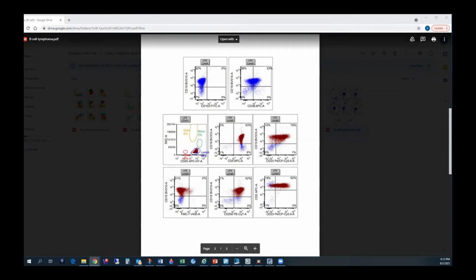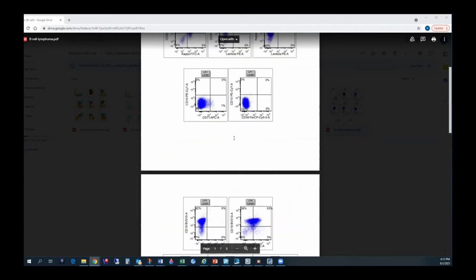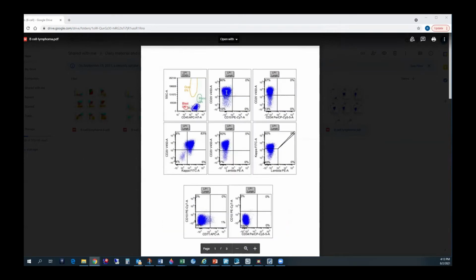One last thing, sorry. You just told about, in the very beginning, the plot of CD20 about the moderate intensity, that you said it's touching the line. What does that mean? I didn't get that part. In the plots above, here. So it's kind of touching this line, right? And you can even see a subset of this population crossing this line on the negative side.